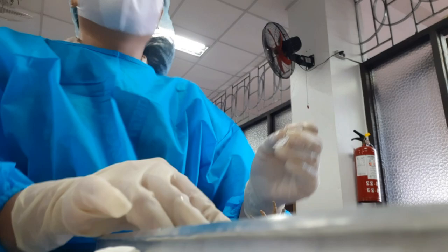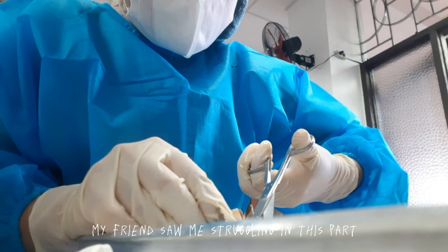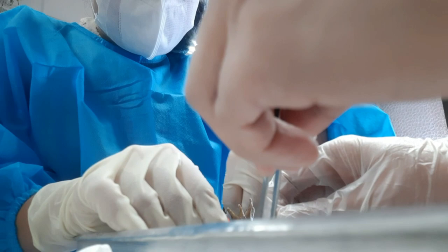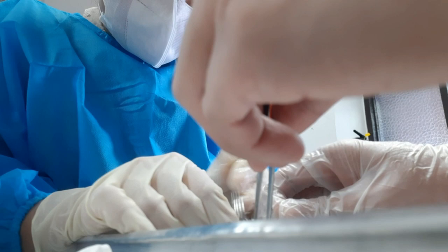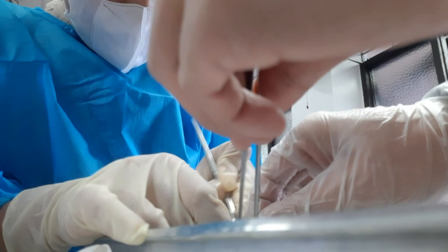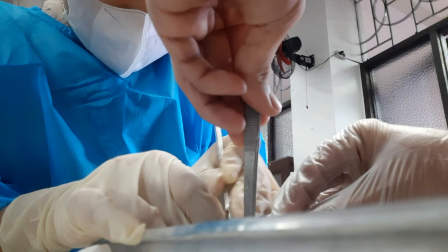Going to cut right on up. All right, as you've noticed, I have now flipped the frog upside down. I've got the mid-sagittal cut from that original opening all the way up through his chin, just a straight cut. You can do the four limbs, but it's usually easier to do them later on. Here we are. I've stopped right here where we would assume our pelvic region is, just before we get all the way down to the cloaca.